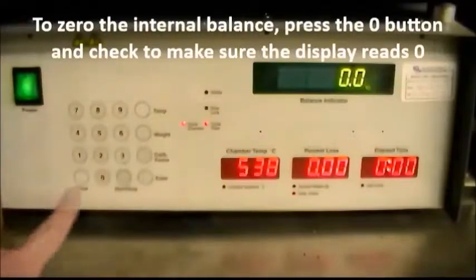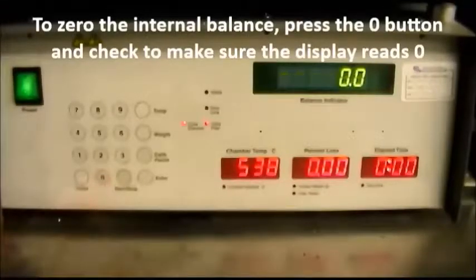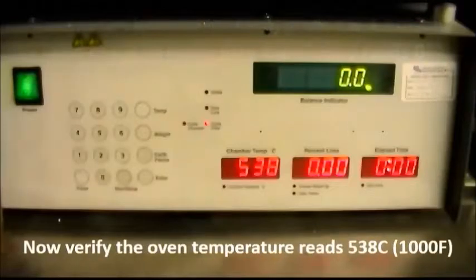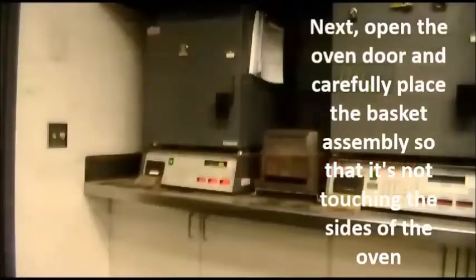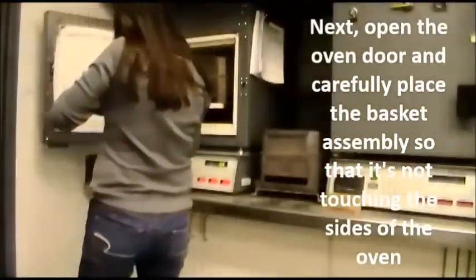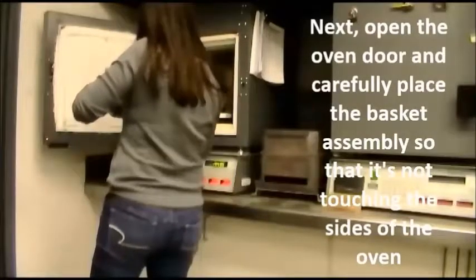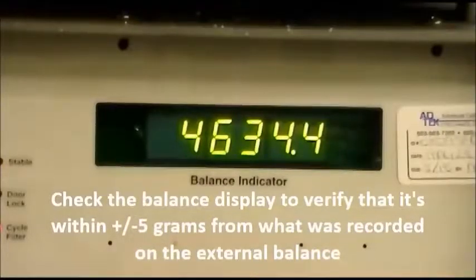To zero the internal balance, press the zero button and check to make sure the display reads zero. Verify the oven temperature reads 538 degrees Celsius or 1000 degrees Fahrenheit. Open the oven door and carefully place the basket assembly so that it's not touching the sides of the oven. Check the balance display to verify that it's within plus or minus 5 grams from what was recorded on the external balance.